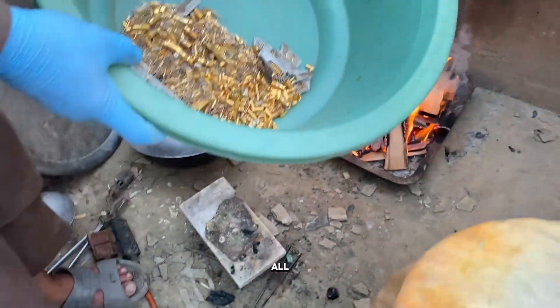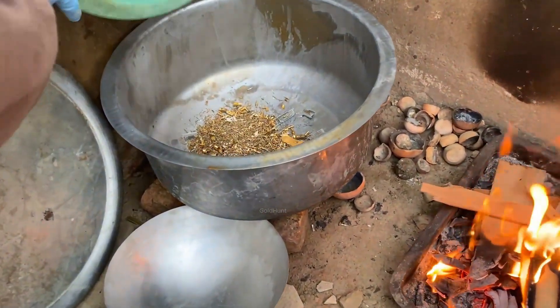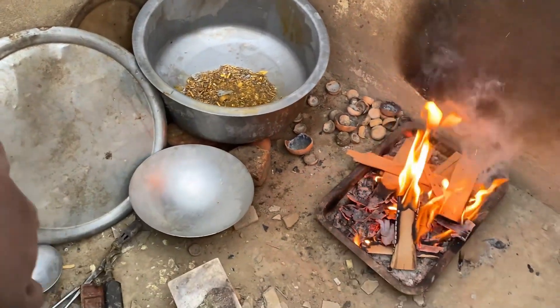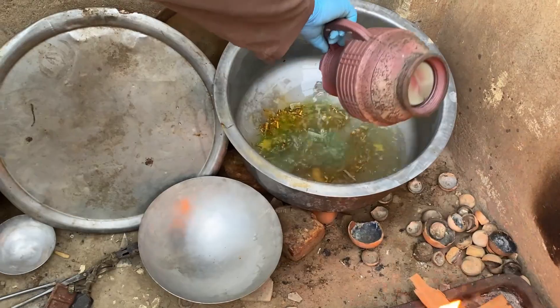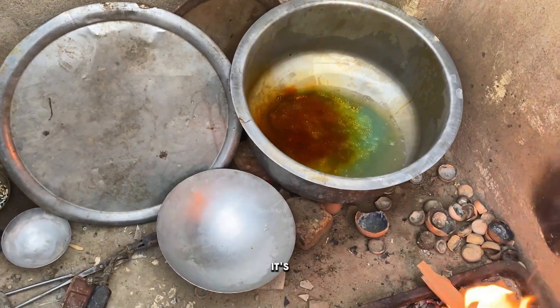Let's start by putting all these gold-plated pins into a metal pot and adding a little bit of water. Next, we'll use nitric acid, which helps separate the gold from brass and other metals. Our process has already begun, and as you can see, it's starting to boil.